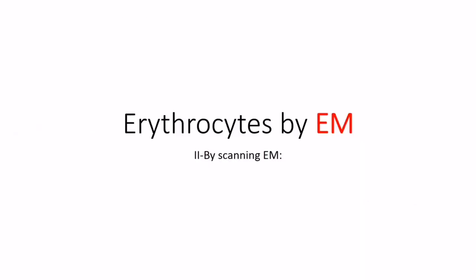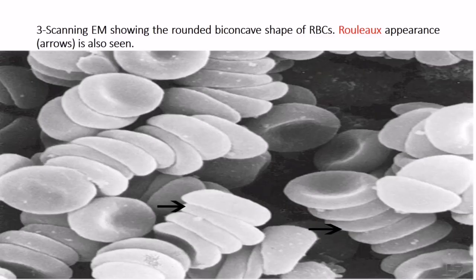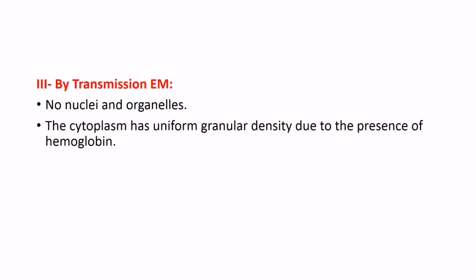Erythrocytes by electron microscope: using the scanning electron microscope, the rounded biconcave shape of RBCs is clearly shown. Rouleau appearance, marked by arrow, is also seen. By transmission electron microscope, there are no nuclei or organelles.